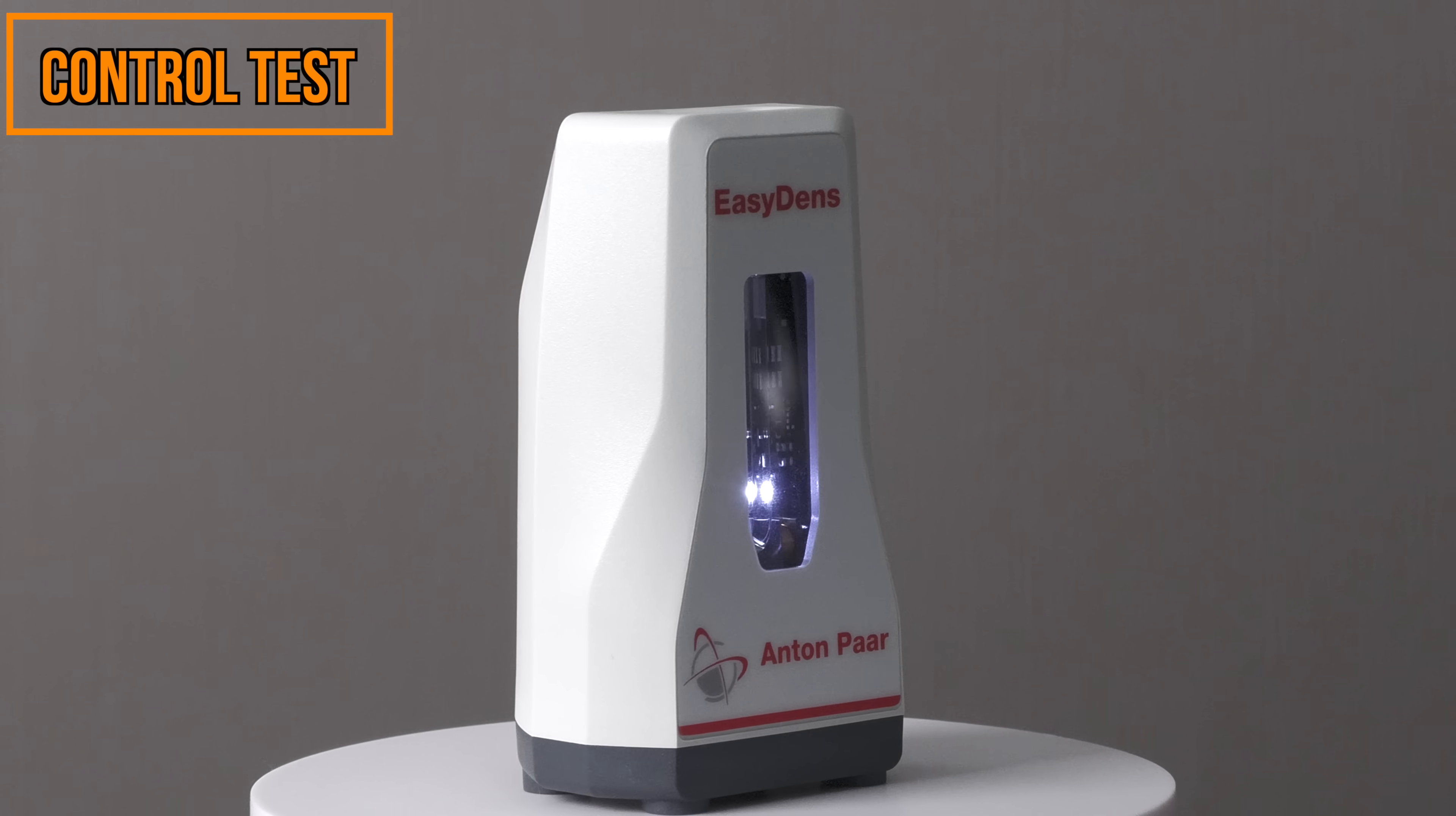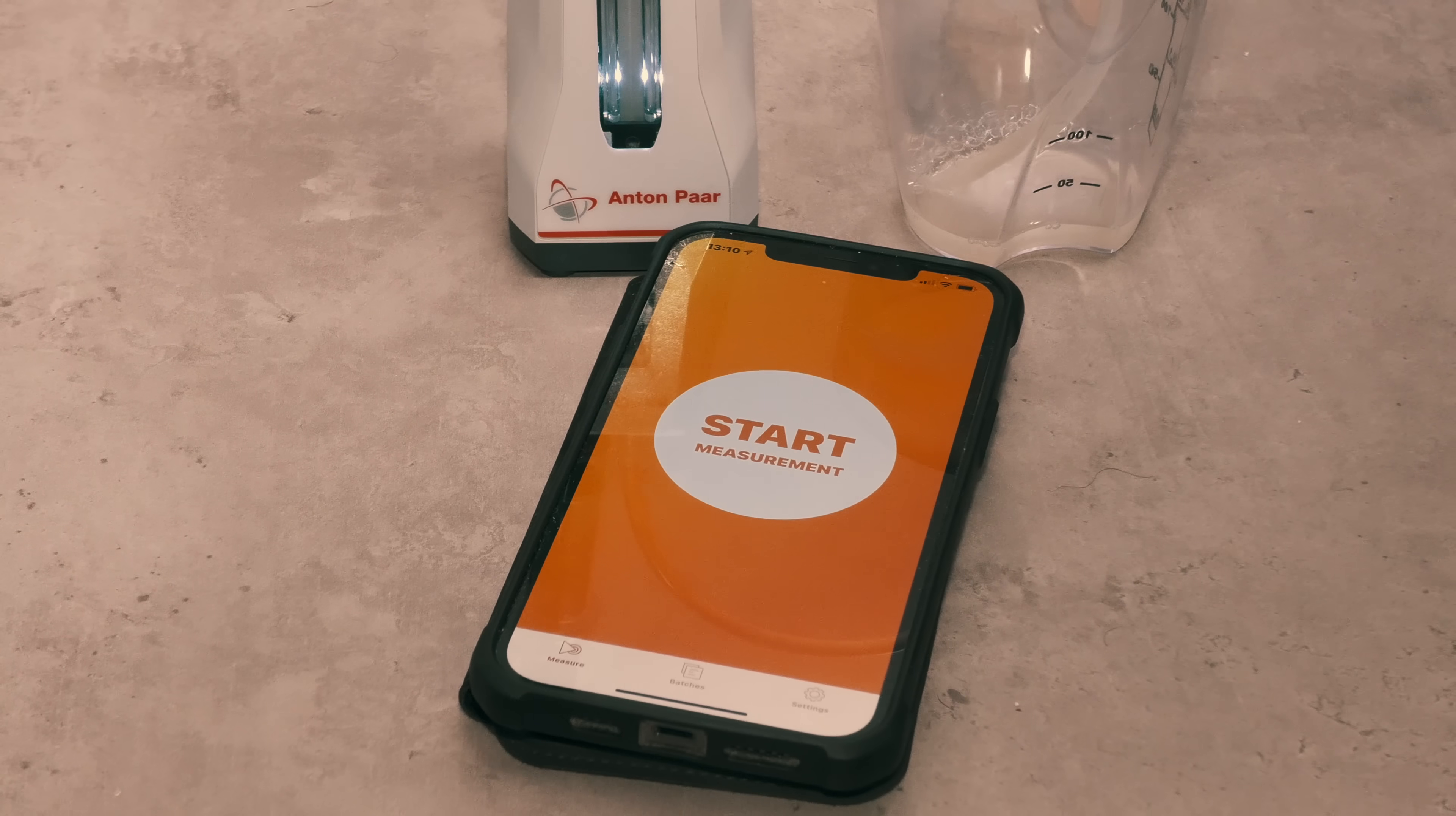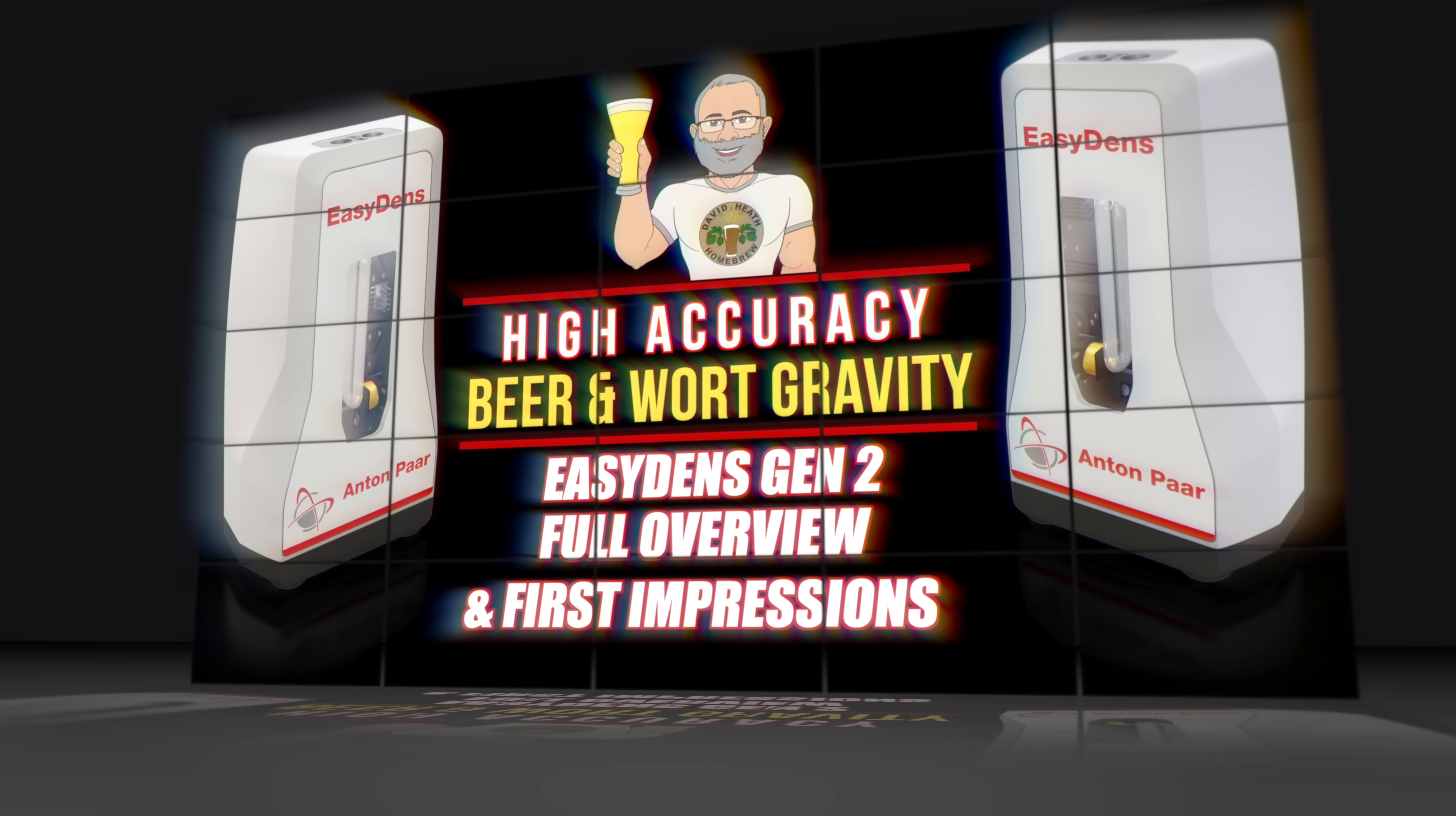I began my testing with the EasyDens because this has the highest level of accuracy of all of these units which is reported by Anton Paar Manufacturer to be 0.001 for specific gravity. The unit will also automatically adjust its readings according to temperature. So as such this is our control unit. The EasyDens doesn't need calibration so it was simply a case of loading in the sample and then firing up the smart app. And now for the moment of truth. Remember that Brewfather predicted an OG of 1.053 based on overall brew house efficiency of 67%. As you can see this figure is 13 points over this prediction meaning that in actual fact I had a brew house efficiency of over 80%, an actual mash efficiency of almost 92%. So when people say that brew in a bag is a method of brewing that has bad efficiency they are clearly wrong. For further details about EasyDens then check out the video now shown on screen that provides I hope everything you would ever want to know.